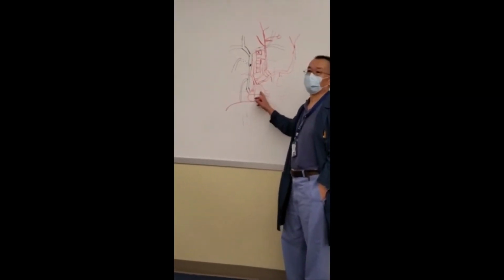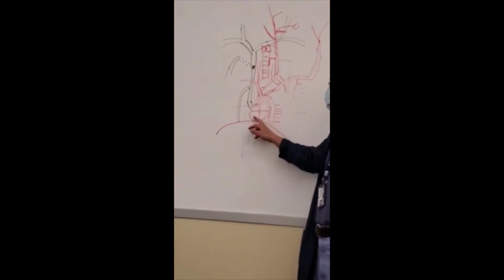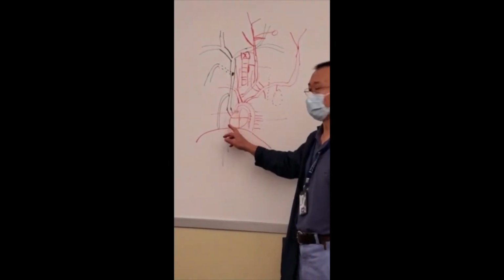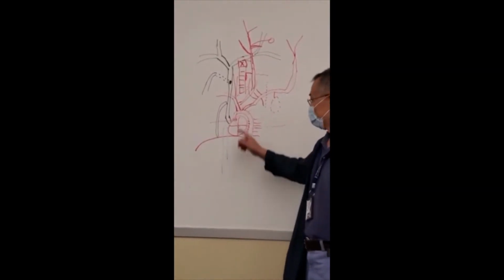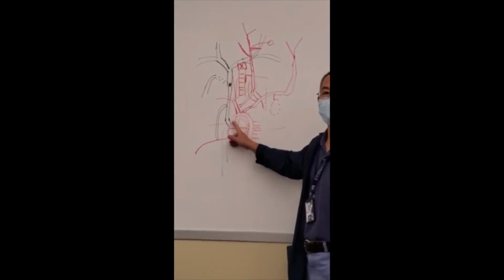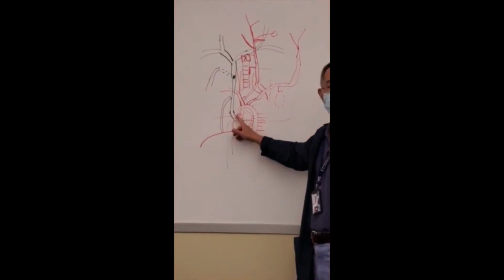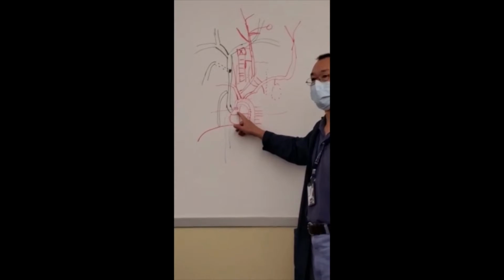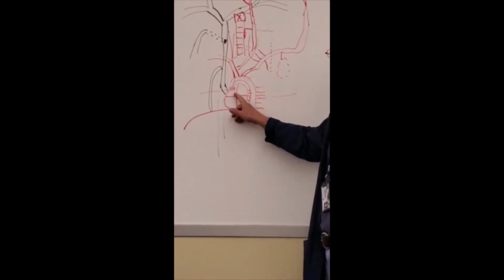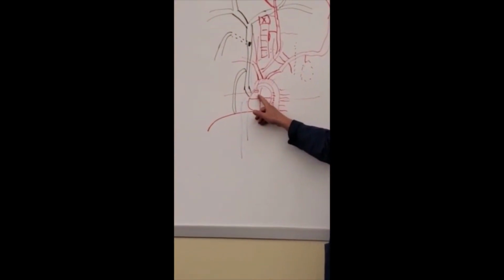So first you locate the heart. Okay, the cat's heart. Nobody should have trouble locating the heart. If you want to see the ascending aorta, you push the right atrium. Use a probe. Push the right atrium a little bit. You see pieces of aorta come out. That's the ascending aorta.